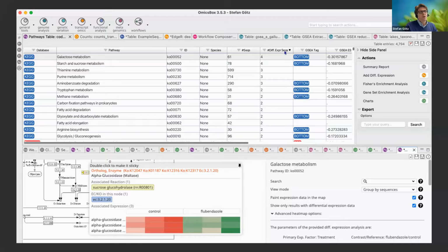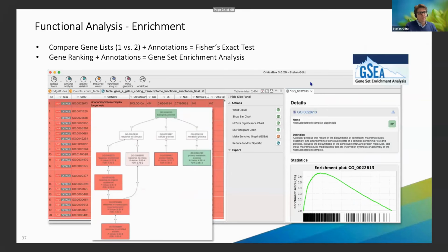And they are actually among my list of down-regulated genes, because this pathway turned out to be down-regulated. So I have my underexpressed genes in my drug condition, which caused the, maybe I can show you in this slide here. Sorry for hopping around.